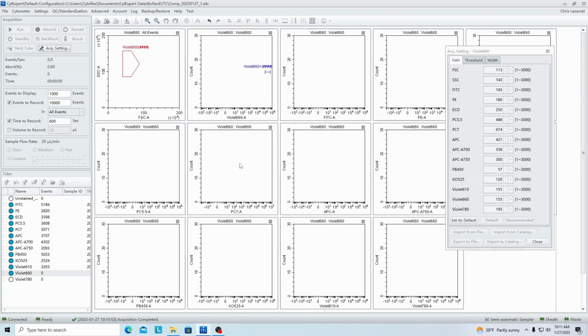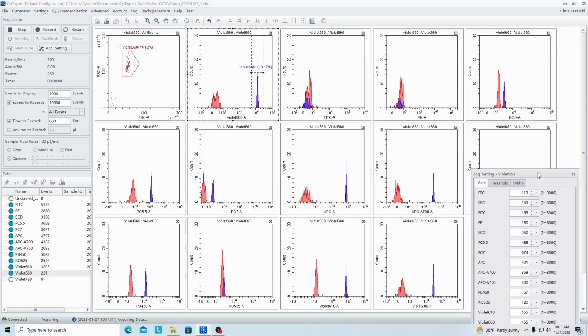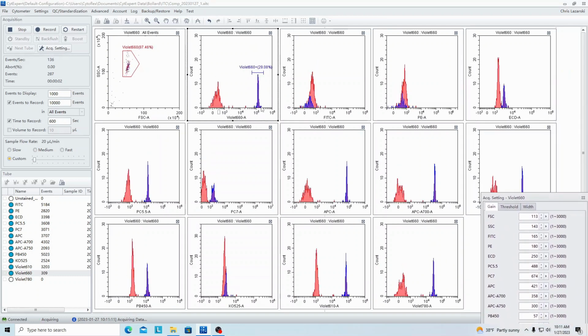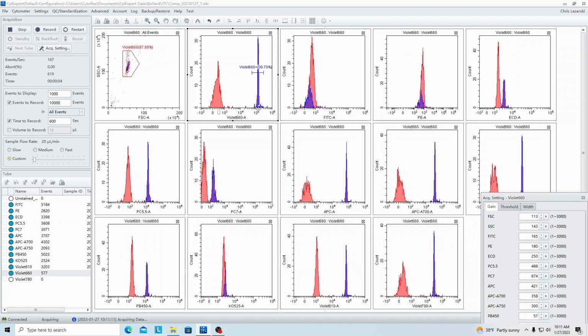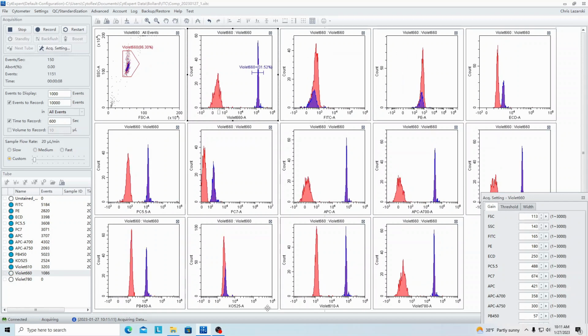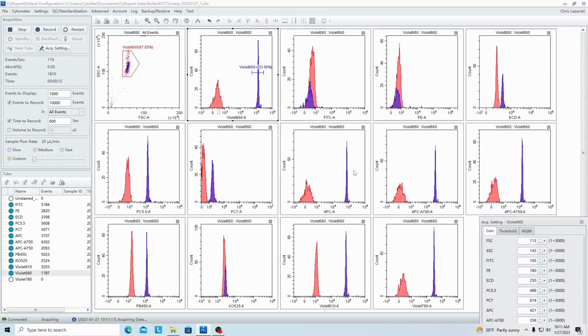So we have 2 more tubes, and then we're going to calculate the compensation. So you want to count visually manually so that... So is that right about 10 to the 5th? Below 10 to the 5th? Below. Definitely below.